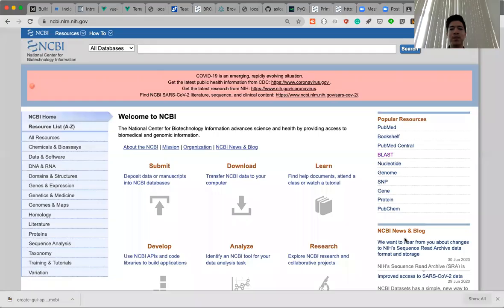And this one is going to utilize the sequence alignment search tool as well. So basically, it uses BLAST under the hood. We don't have to do that by ourselves, but it's going to use BLAST to do the job. And it actually has some other features that can help us design a good primer for our experiment.